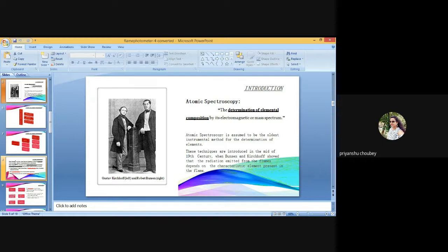Do not feed highly concentrated acid and salt solution. Maintain a constant supply of air gas mixture to the burner. Do not leave the flame unattended. Periodically replace the pressure tubing of the fuel gas.